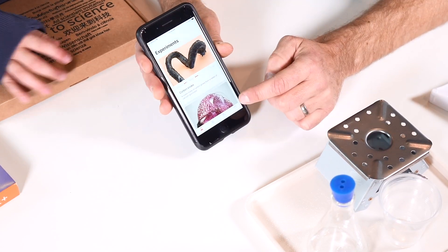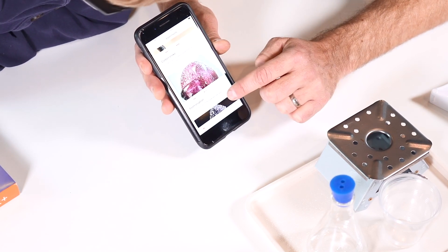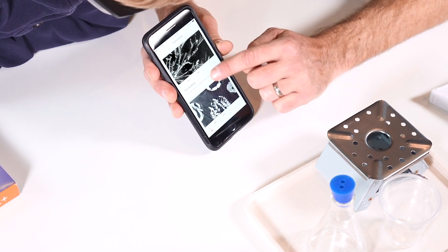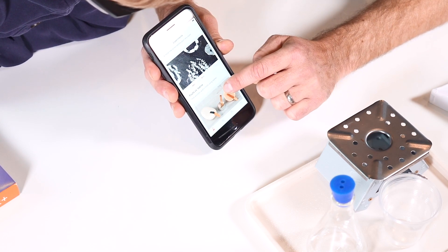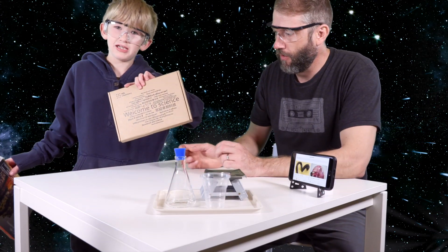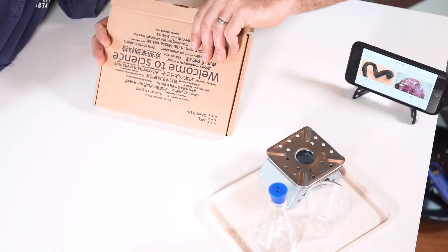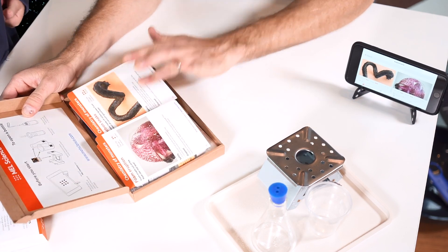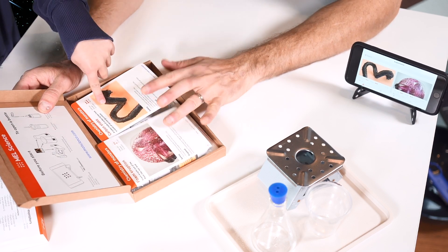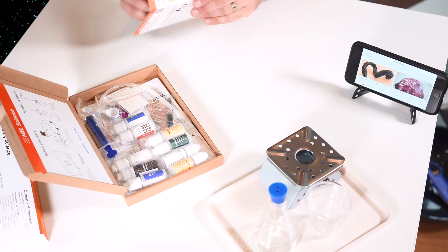So it looks like in the app we have experiments: carbon snake, foam eruption, tin hedgehog, tin dendrite, and fruits versus iodine. Interesting — it says welcome to science in a bunch of different languages. So we have foam eruption and carbon snake as the first two experiments. Which one are we going to do first? Carbon snake. We'll set foam eruption aside for now.